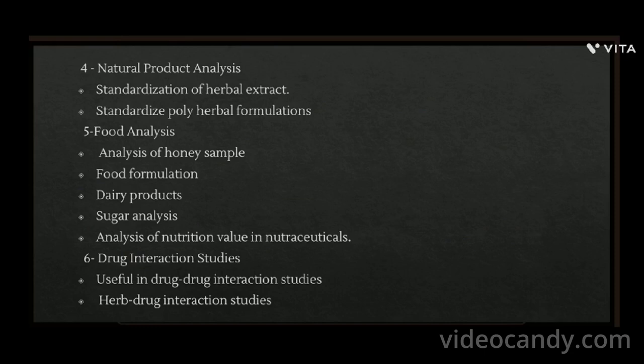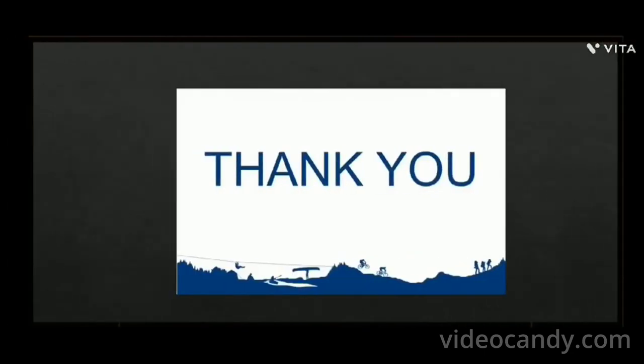Fifth, food analysis. Analysis of honey samples. Second, food formulation. Third, dairy products. Fourth, sugar analysis. Fifth, analysis of nutritional value in nutraceuticals. Sixth, drug interaction studies. Useful in drug interaction studies.